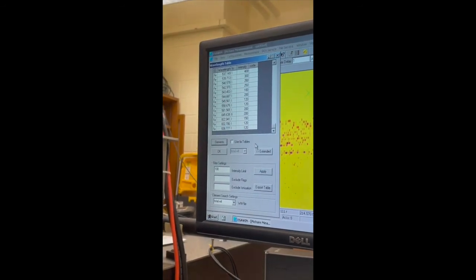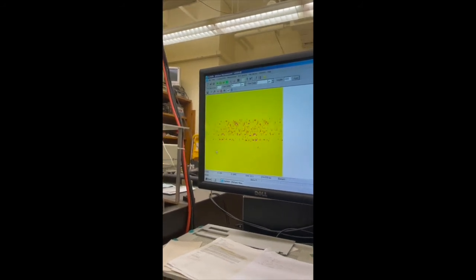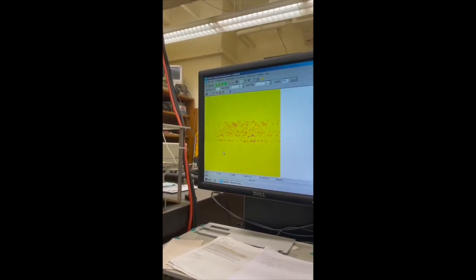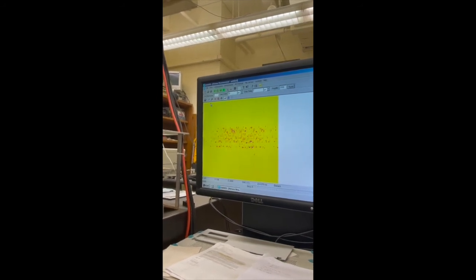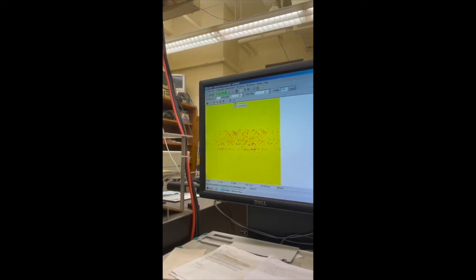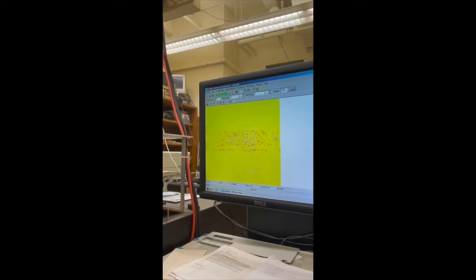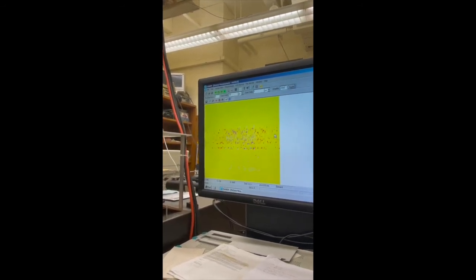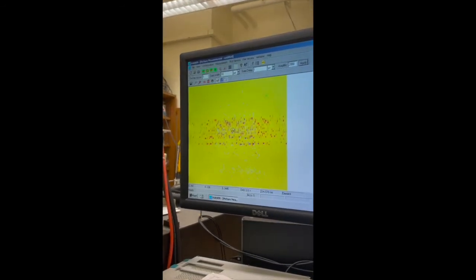Let's see where they actually line up on this window. So if you say OK. And how do I bring up those lines on the picture view here, Dr. Rehse? If you go up to the last set of icons right above the yellow box, the thing at the far right says mark the wavelength. So every one of those emission lines in that previous table is now being marked on top of the camera where those lines are supposed to be. So let's go ahead and zoom in on that.